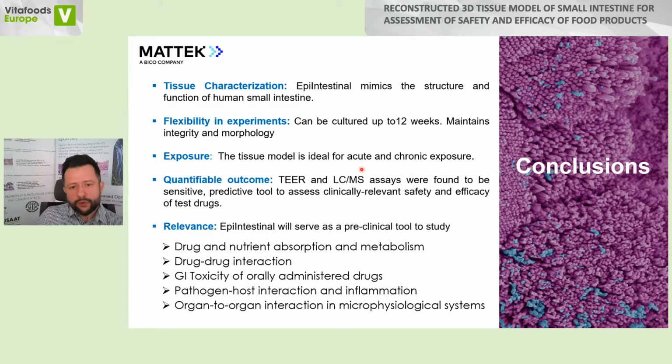It can be exposed in acute and chronic way, and also it can be exposed by different modalities because it's a planar thing, so you can mimic the luminal exposure by applying the compounds on top of the tissue, or the systemic one coming from the bloodstream if you add your compounds into the basolateral medium. And as I have shown you, it can be used in different areas of your research.